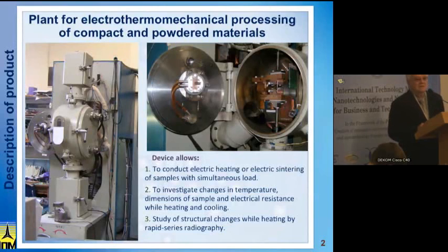X-ray analysis, and that's why we would like to apply this method. What is needed? Of course, the exposure should be lower, but how? The core of the method is, of course, using a powerful X-ray, which can be a standard X-ray tube if we're not using the synchrotron.